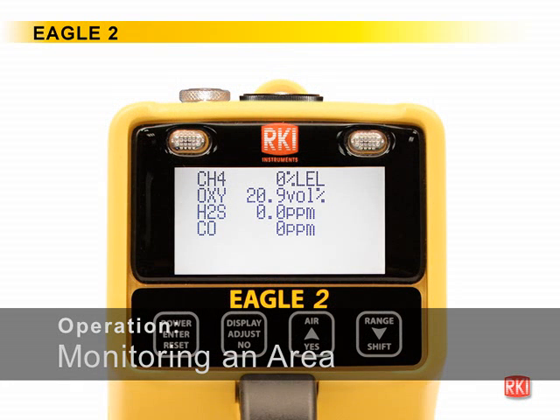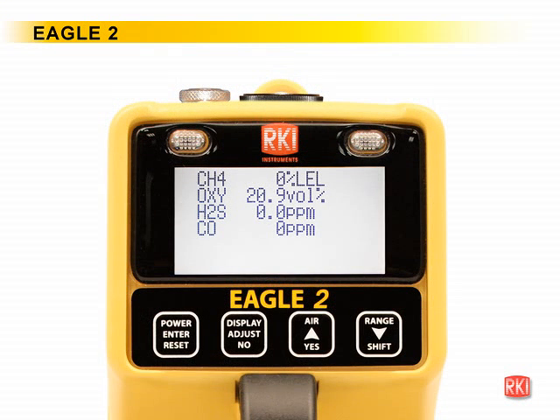Start up the Eagle 2 as described previously. Take the Eagle 2 to the monitoring area. Wait 10 to 15 seconds and observe the display for gas readings. If a reading is observed, allow the reading to stabilize to determine the gas concentrations present.